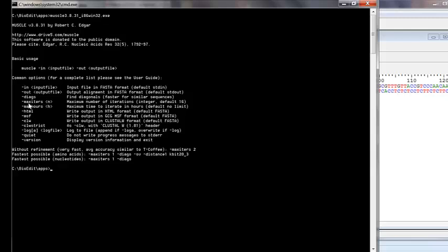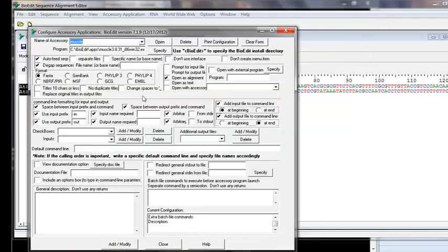The '-maxiters' option requires a user-supplied number: you write '-maxiters' (space) and the iteration count. Other options like '-diags' are just flags — if the flag is present, the program behaves a certain way. We'll demonstrate both: adding a flag-type option and adding one that requires a numeric input.